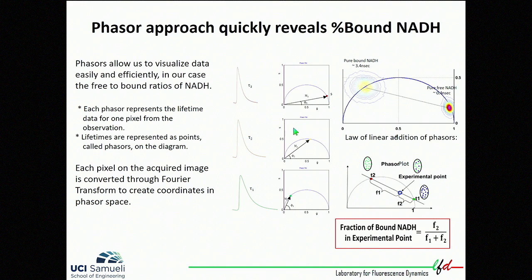So our actual contribution to this area is not FLIM, but it's the contribution of actually graphically representing this data. Typically, what researchers do is that they obtain this lifetime decay curve, and this has to be fitted using single exponential or multi-exponential decays. However, with the polar coordinate system, which is what you see here, it allows us to just select all the pixels in our image and plot them in this polar coordinate plot, making the data much simpler and easier to analyze.